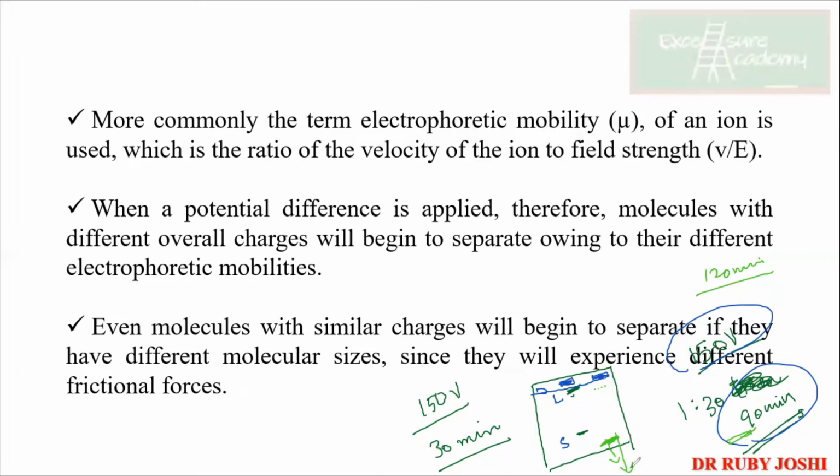Yes, ma'am. Okay, cool. So these are important. This understanding, this concept is important because आगे जाके जो questions आएंगे ना, it is based on all these fragments only. कोई आपसे ये नहीं पूछेगा कि अगारोस क्या चीज से बना है. ठीक है, nobody is gonna ask unless you are giving 11th का exam. तो वो वहीं पर ही पूछा जाएगा, otherwise nobody is going to ask. जो भी कुछ पूछेगा यही पूछेगा. And based on this only, if you know that forensic science details also, like how to catch the criminal using the DNA fingerprinting, how to check for the paternity test, right? So all these things are coming as an application of your Agarose Gel Electrophoresis.